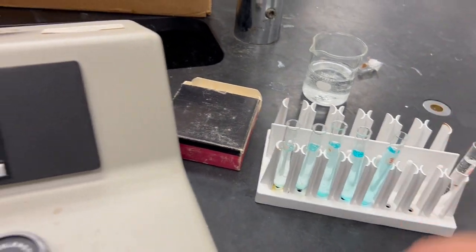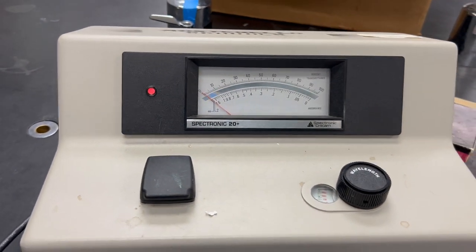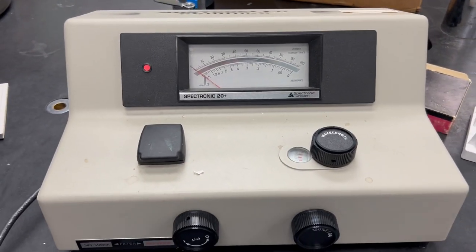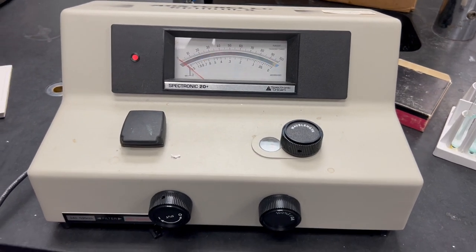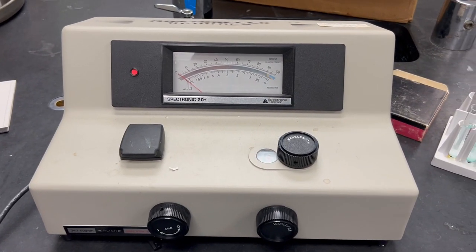Now you can take out your sample, put it back, and go for another sample if you want. That's the operation of the Spectronic 20 Plus spectrophotometer.